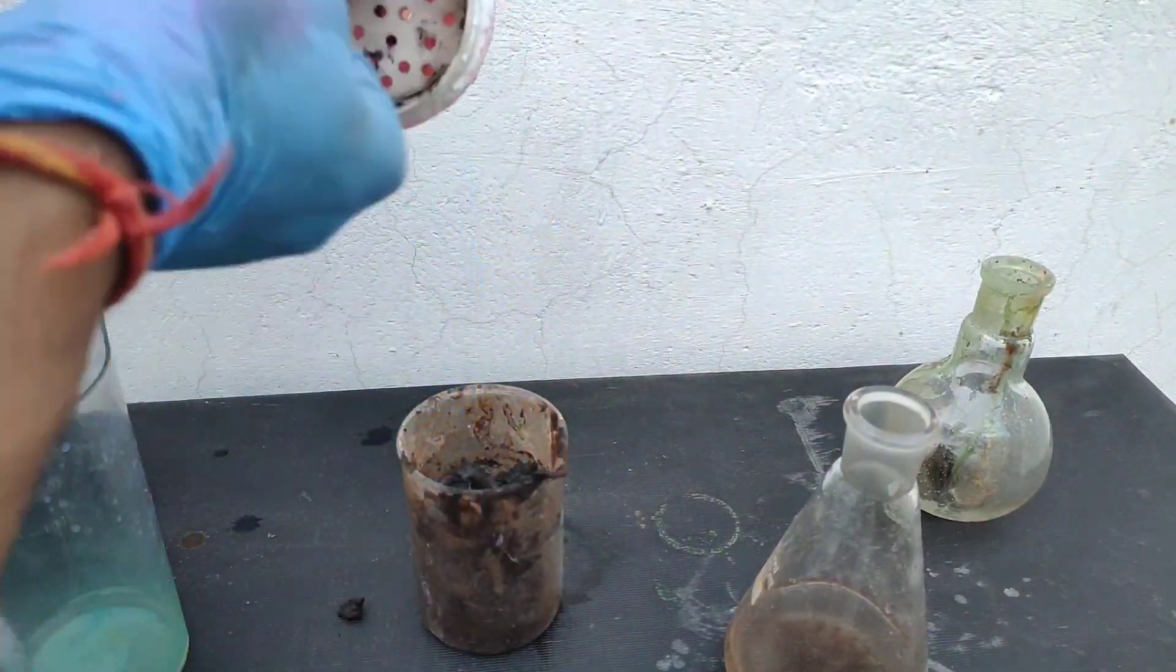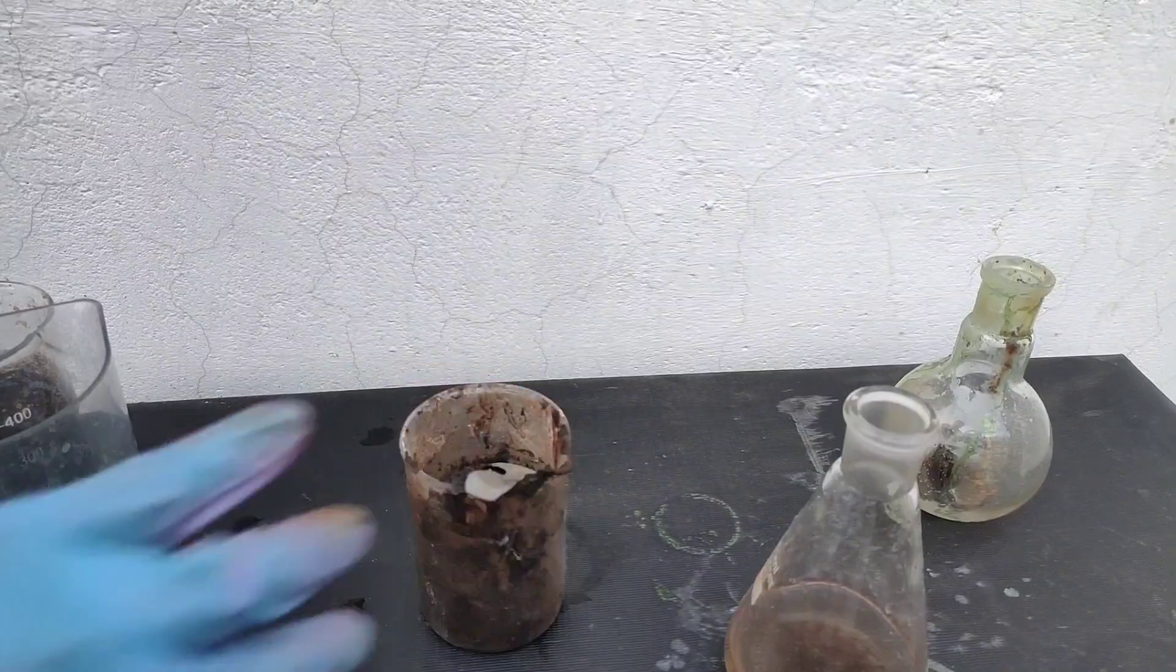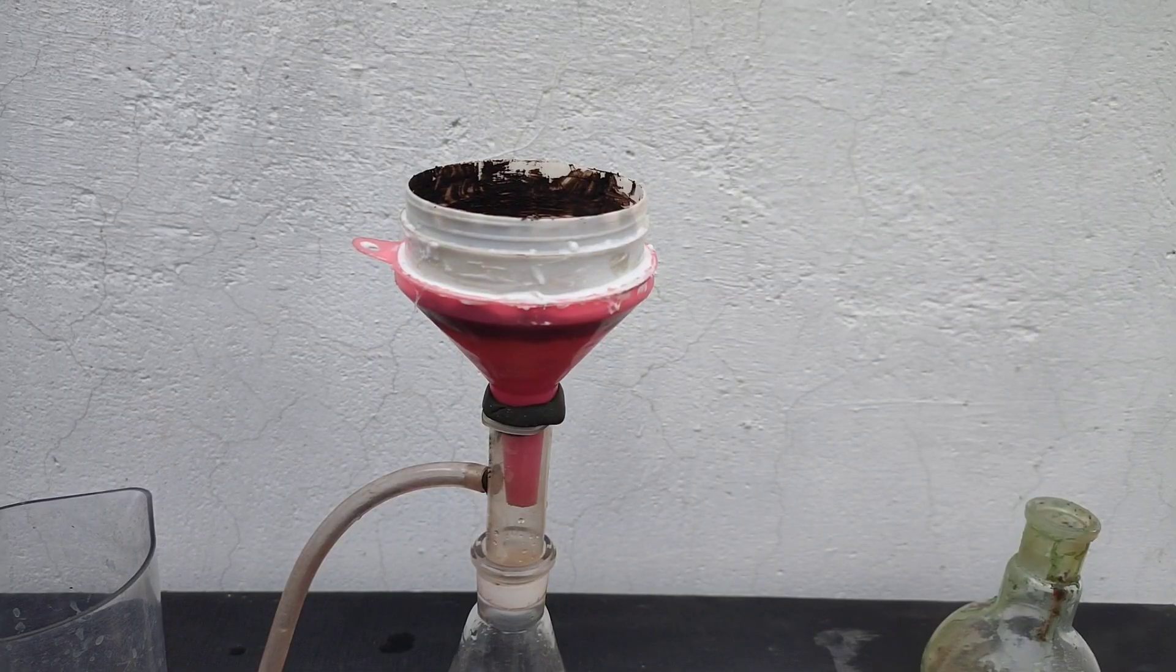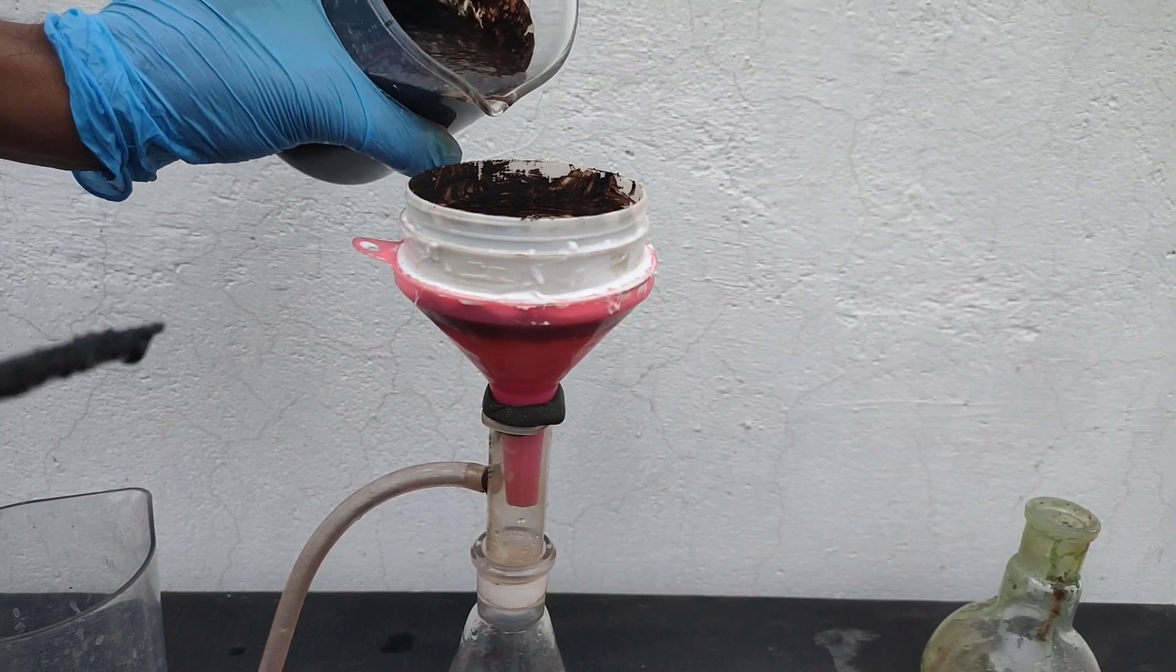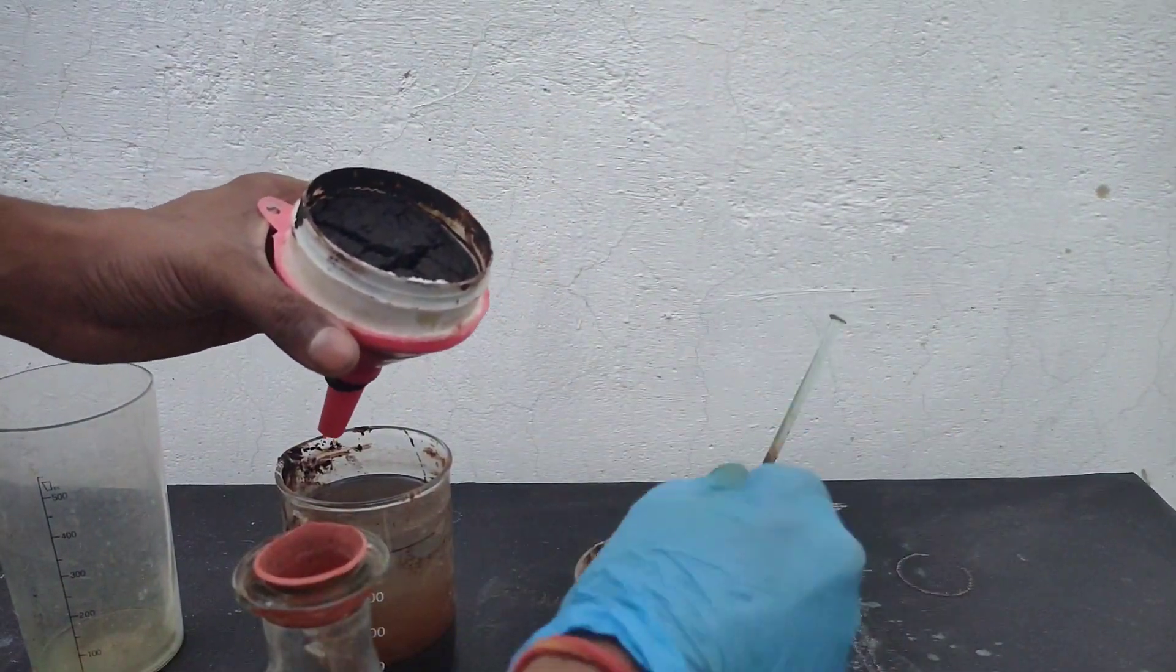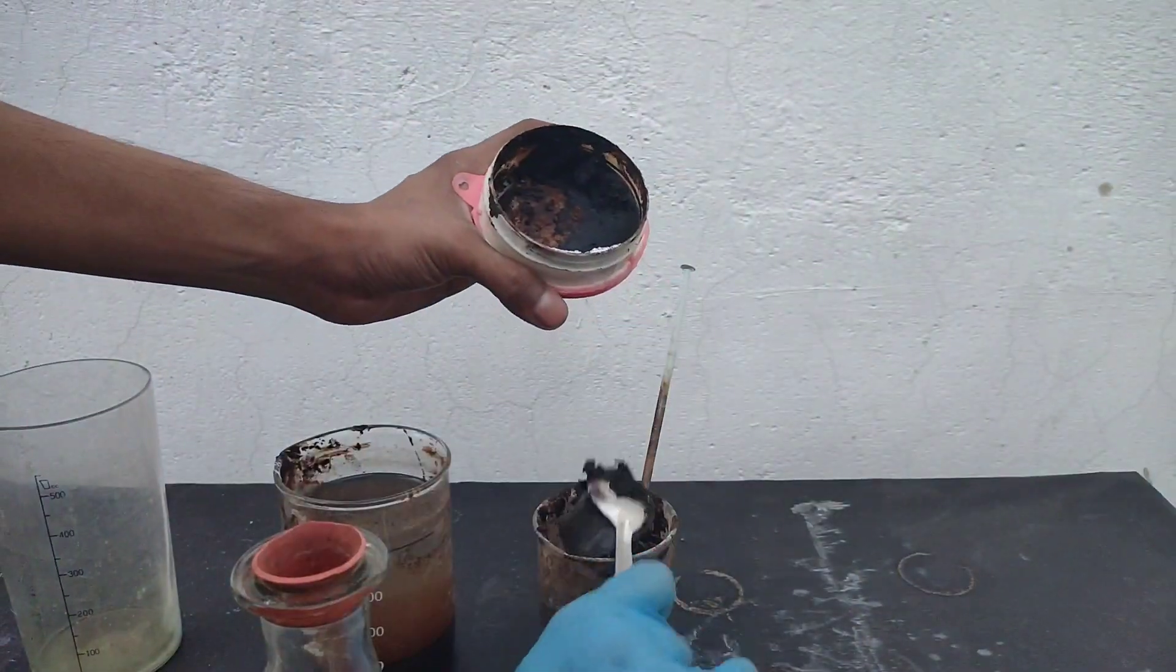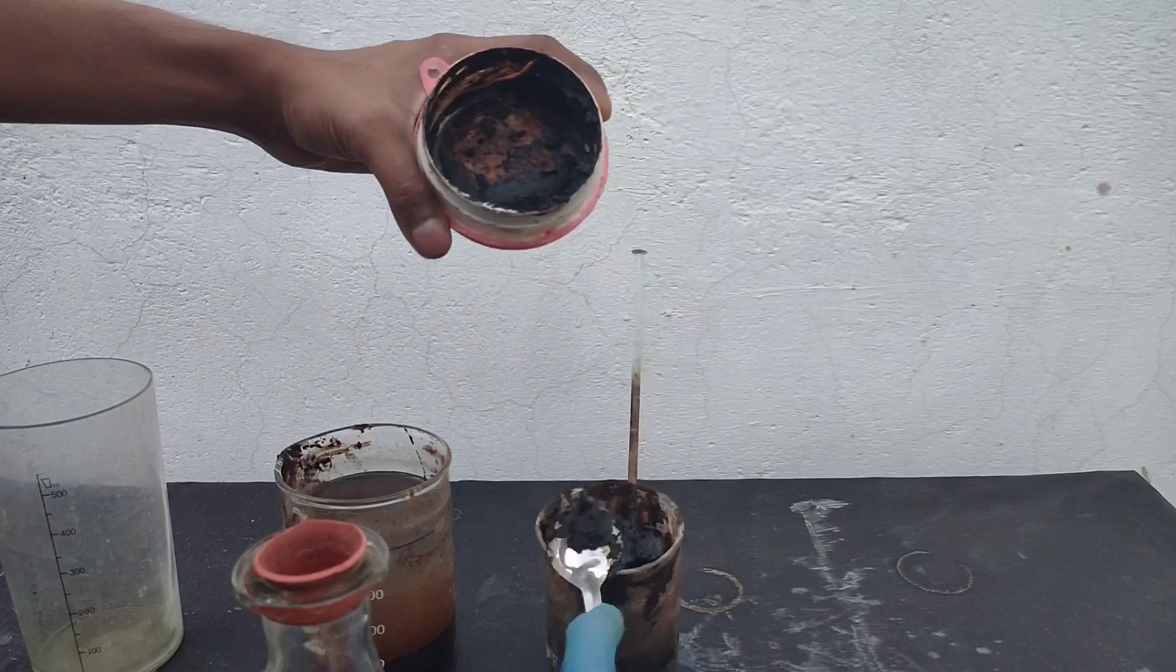After filtration I transferred the precipitate to the beaker. Then I filtered my precipitate made by chemical method. The precipitate was excess, so I added only half the amount into the Buchner funnel and washed the precipitate with water to remove soluble salts. This precipitate was also combined with the previous precipitate.